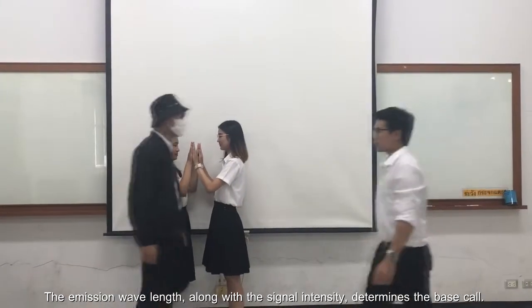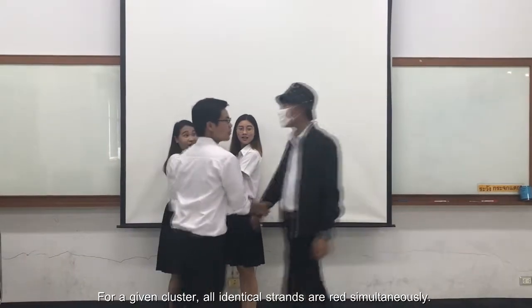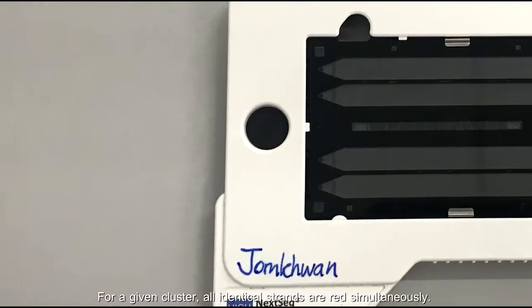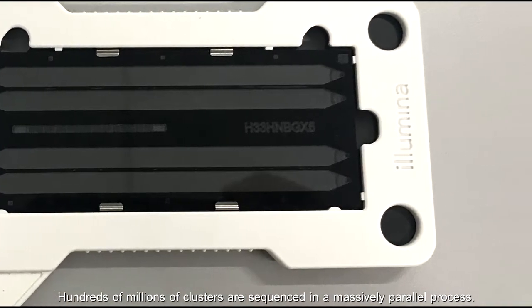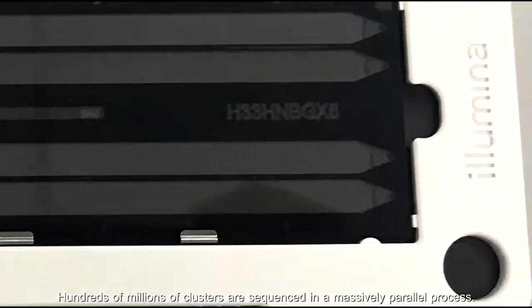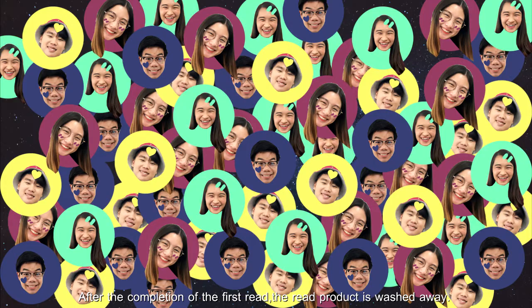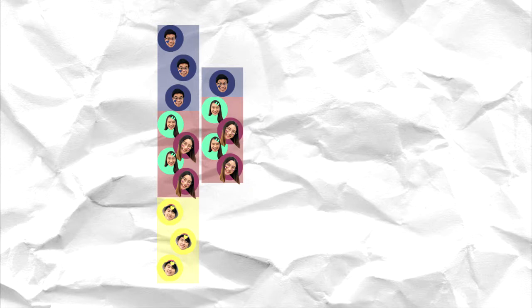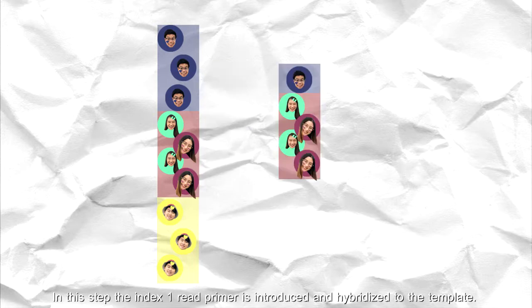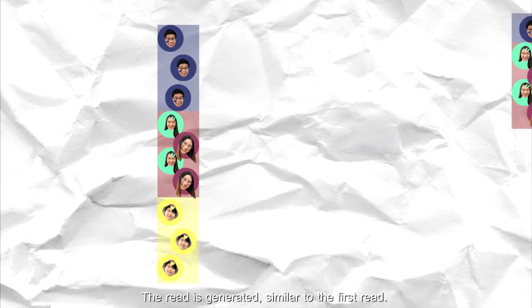The emission wavelength along with the signal intensity determine the base call for a given cluster. All identical strands are read simultaneously. Hundreds of millions of clusters are sequenced in a massively parallel process. This image represents a small fraction of the flow cell. After the completion of the first read, the read product is washed away. In this step, the index 1 read primer is introduced and hybridized to the template. The read is generated similar to the first read.